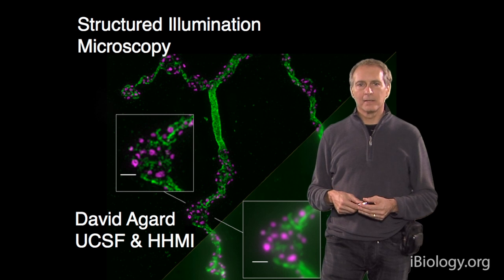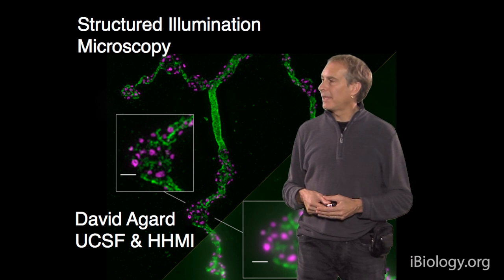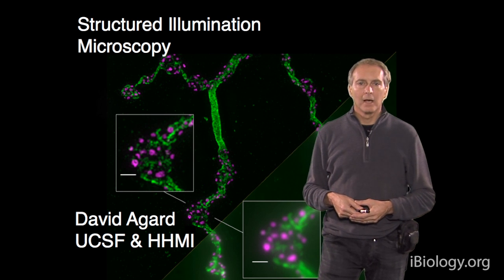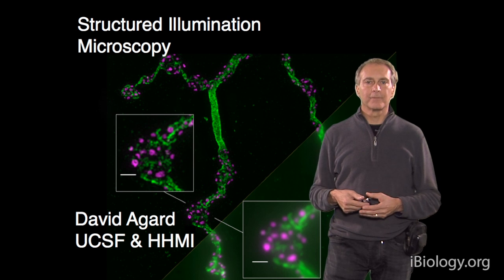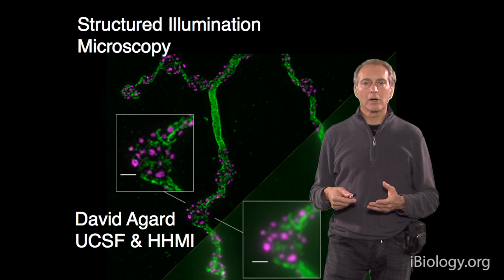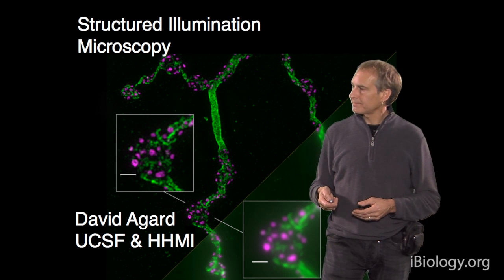And in this lecture, I want to talk about going beyond the diffraction limit using conventional microscopes. It's a methodology known as both structured illumination microscopy as well as interference microscopies. And we'll be talking about both these in terms of what their potential is for biological imaging.